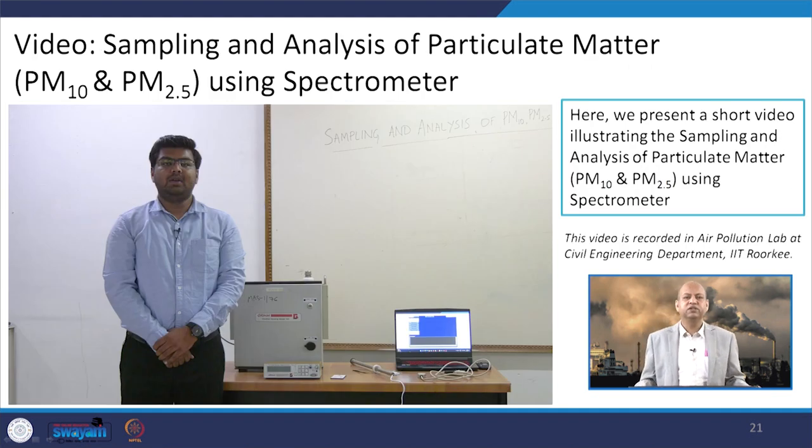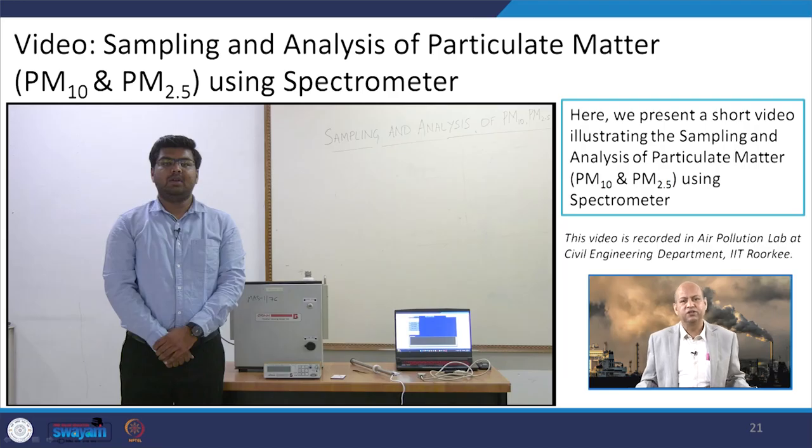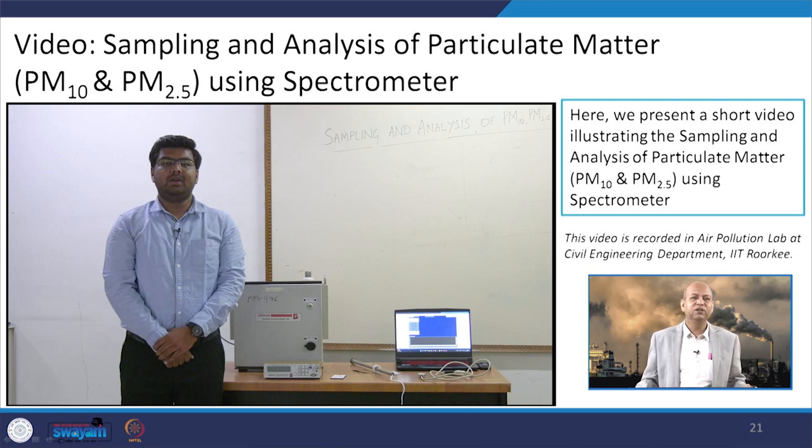Here we present a short video illustrating the sampling and analysis of particulate matter, especially PM10 and PM2.5, using the spectrometer. You can compare the high volume sampler and spectrometer — how they function, the differences in procedures, which is more robust, and the range, including PM1 and below. This video was recorded in the air pollution laboratory of the civil engineering department at IIT Roorkee. Enjoy the video and learn about PM10 and PM2.5 monitoring using the spectrometer.